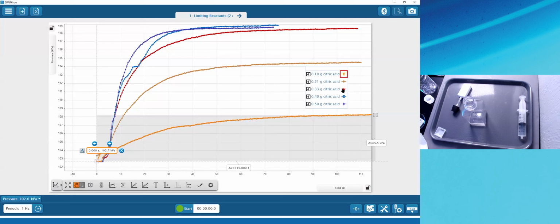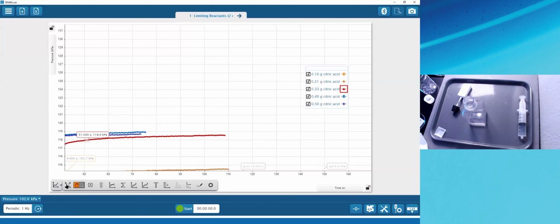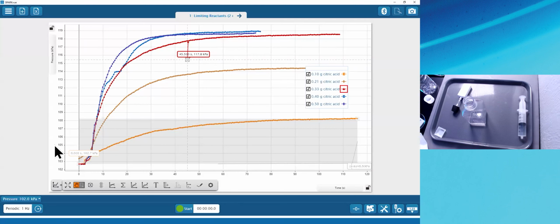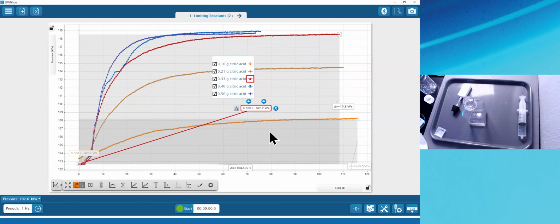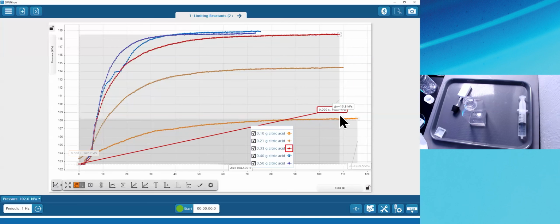I'm going to skip to the red run. So I changed to the red run. I'm going to do my coordinate there. So you see how it saved. Whoops. See, that happens every now and then. We're going to use the delta tool here. And I can move that to wherever makes sense. Stuff is movable because there's always stuff in the way, right? So stuff is movable.